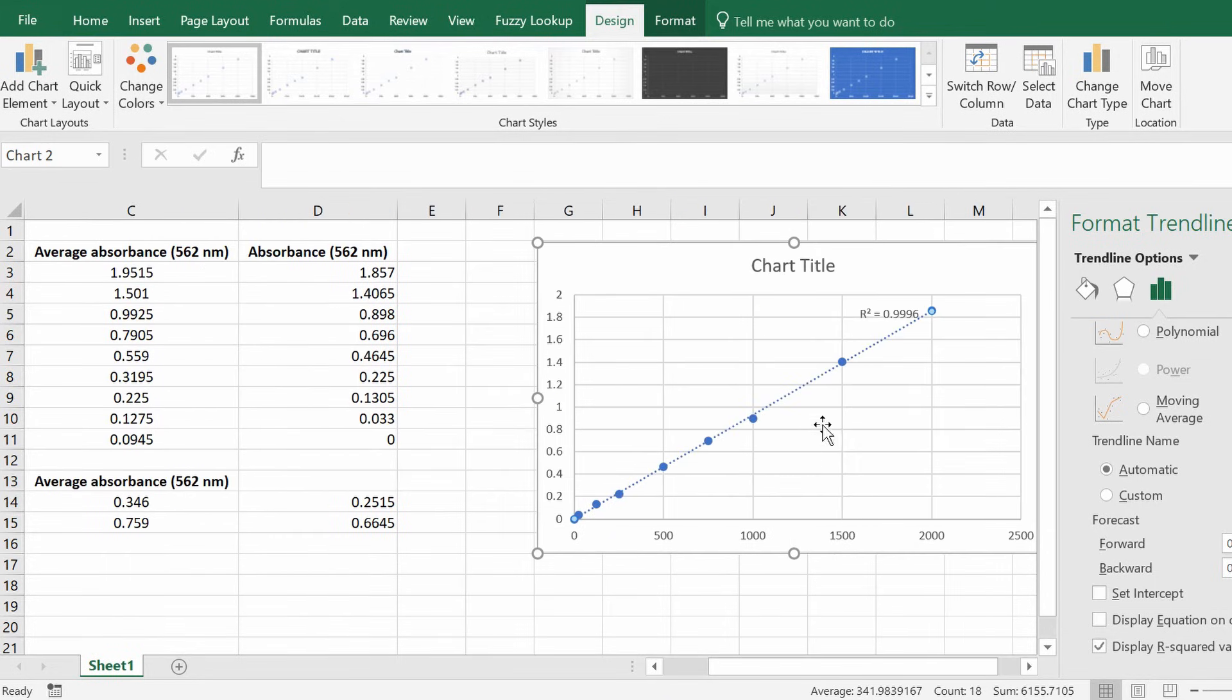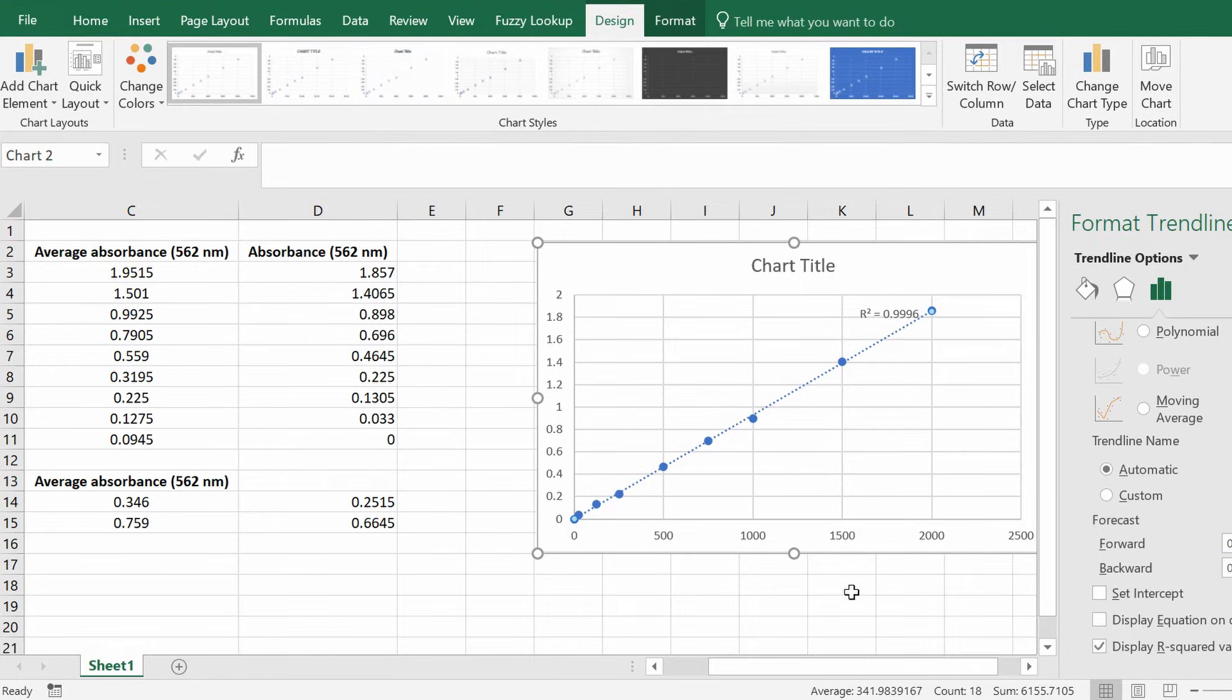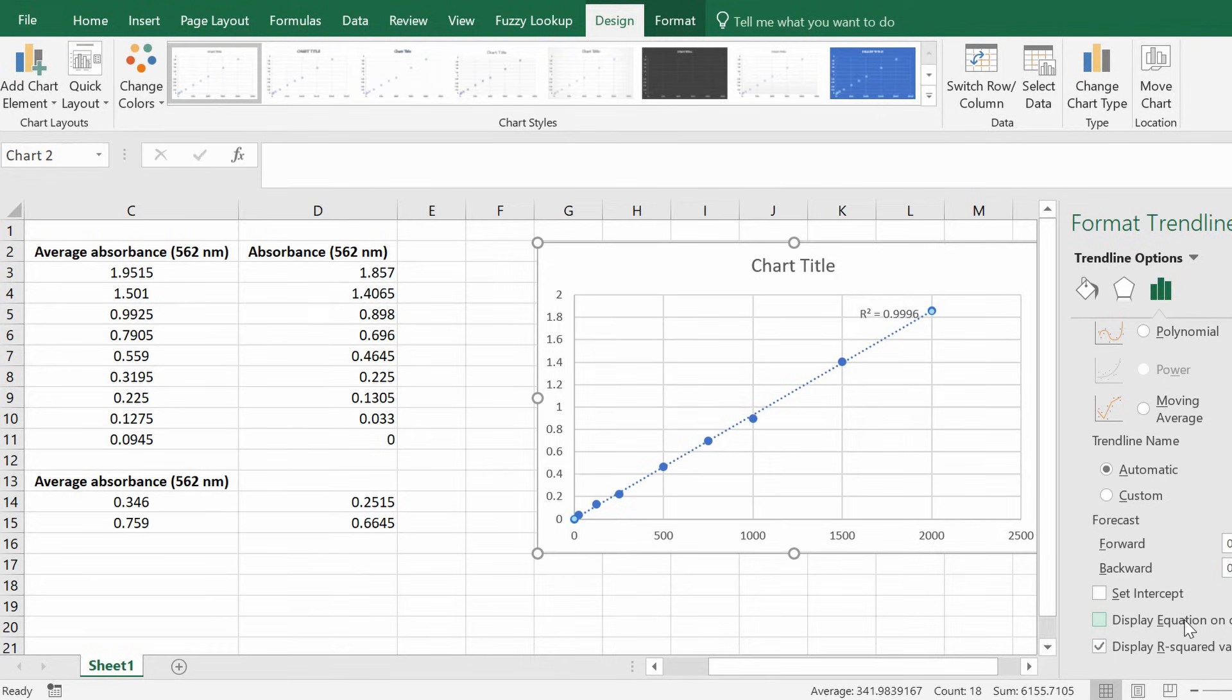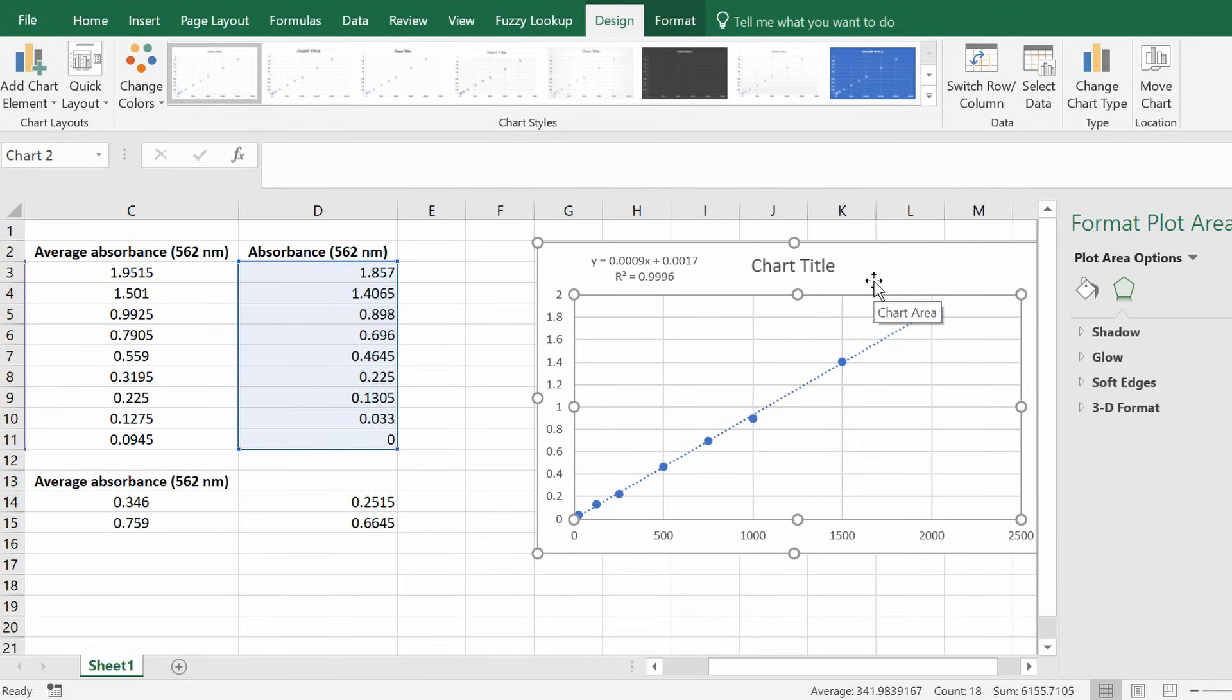So the very one at the bottom where it says display r squared value on chart you can click this and move this across. So the r squared is essentially how close your values are to the line of best fit running through it and this is a value between zero and one. One being a very perfect correlation and you can see here that the correlation is 0.9996 which is a perfect line pretty much. The other thing we need is to display the equation on the chart. So the equation is the main thing we need here. So click this.